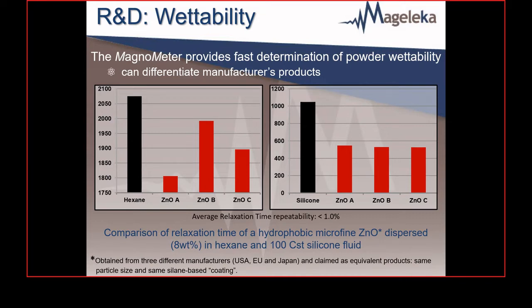Now, for those who are not familiar with silanes, the basic silane is an inorganic compound, silicon hydride. And silanes as a group are compounds with up to 4 substituent ligands on the silicon atom itself.